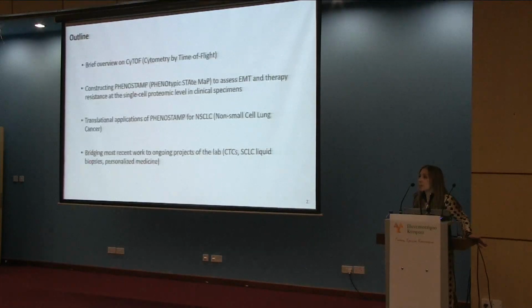First I will talk a little bit about the technology we use in my lab, which is called cytometry by time of flight, and the strengths it has to study cancer. I will also talk about a tool that I developed during my postdoc that helps you analyze clinical specimens at the single-cell proteomic level. And I will talk about its applications for non-small cell lung cancer, but also how I bridged previous work to work in other types of lung cancer, like small cell lung cancer, and in general to study solid tumors, circulating tumor cells, and liquid biopsies.